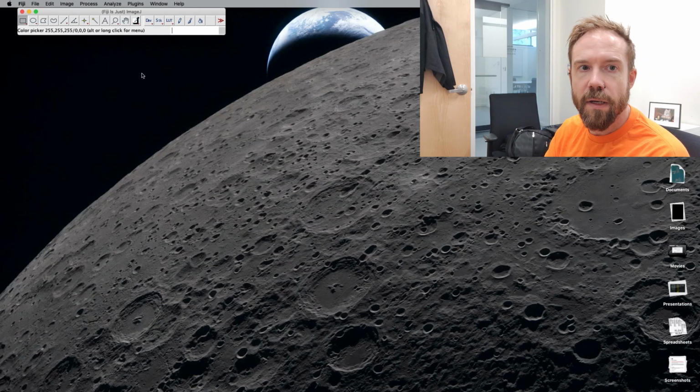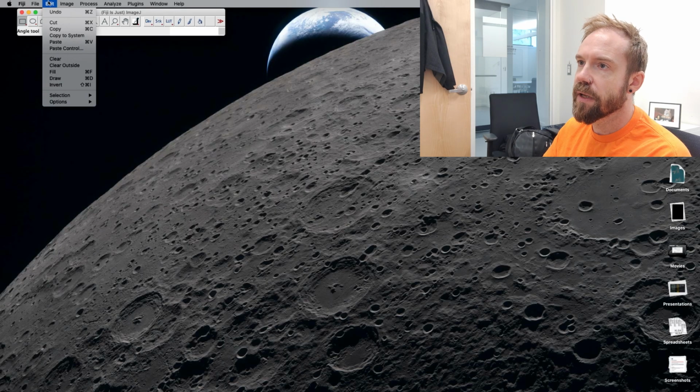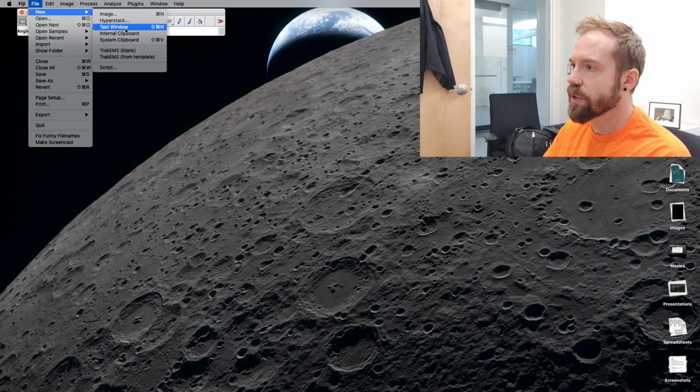Hi. So here I'm just going to be introducing the concepts of variables. We're going to talk about strings, we're going to talk about numbers. You should be able to see my computer screen, and what I'm going to do is within FIJI that I've just opened, I'm going to go to the file menu, select a new text window.